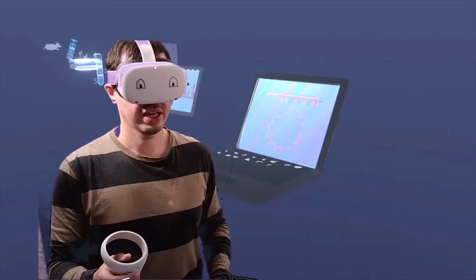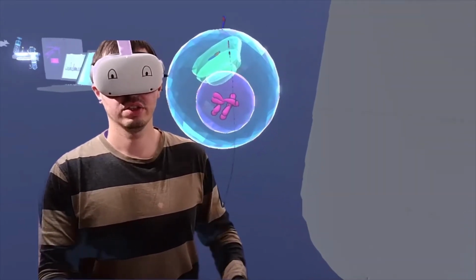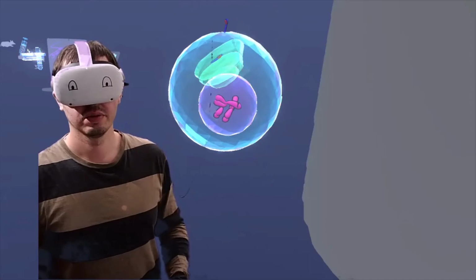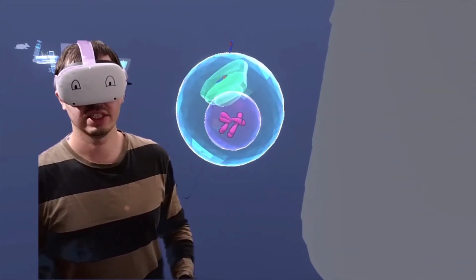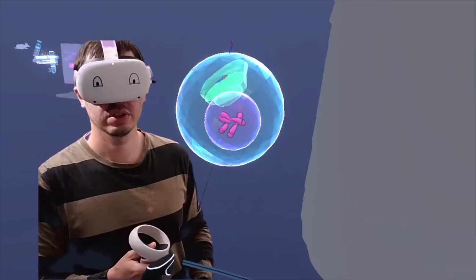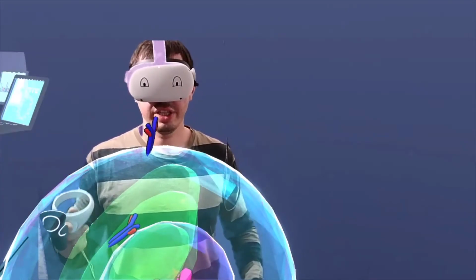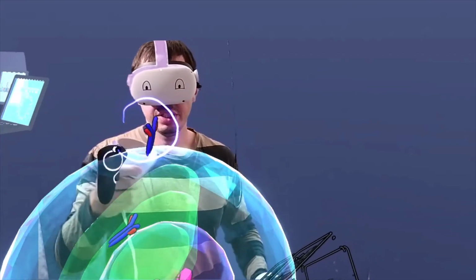Now this cell has nothing to do with the B lymphocyte from the mouse. It is a cell which can be from any organism, ranging from a plant to a human cell. And this cell is going to be your manufacturing facility. Your genes have been knocked in. So you have the sequences encoding your protein inside the cell, and this cell is actually able to synthesize the protein that you need here.